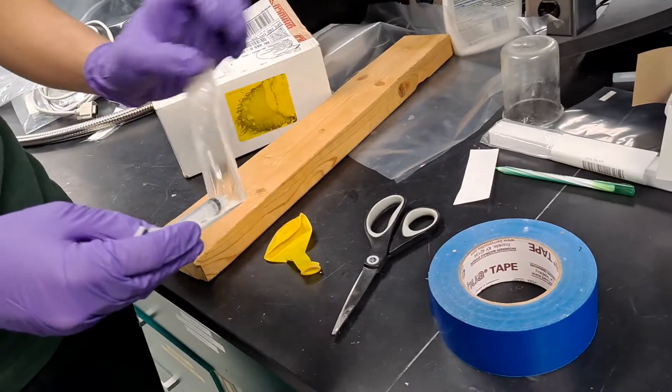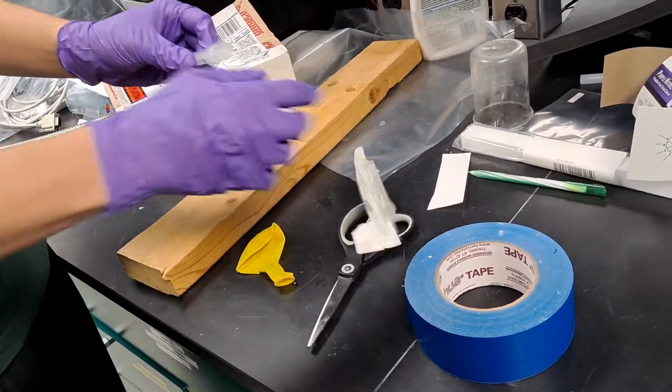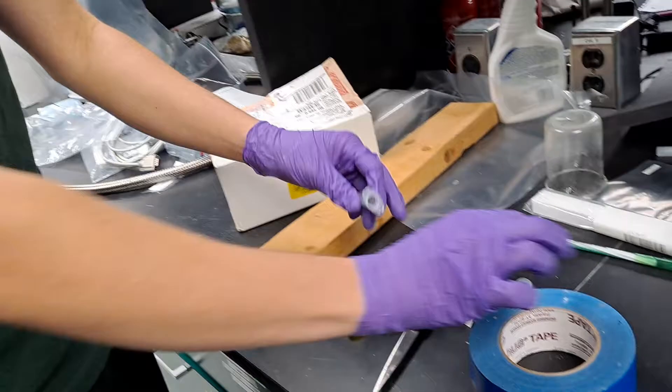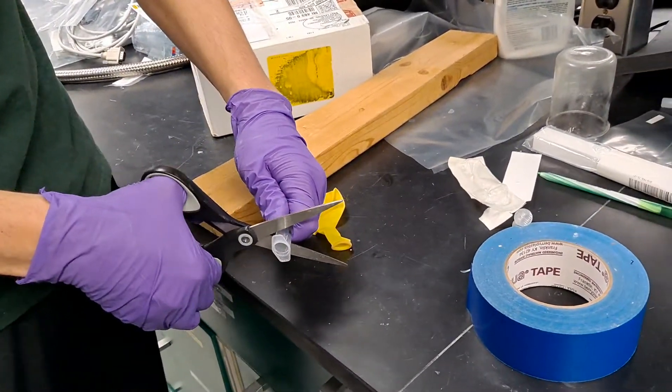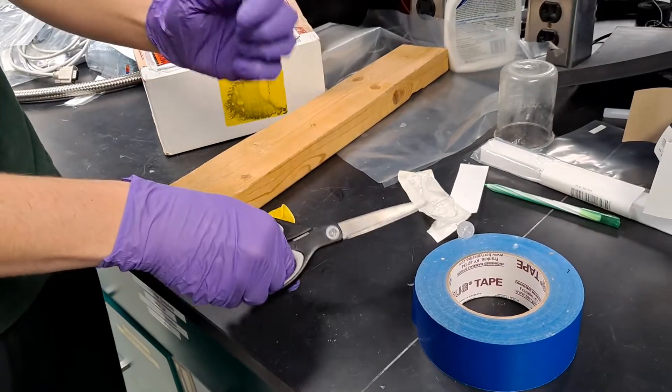First, what you do is you take the syringe out of the packet and you take the stopper out. Then use the scissors to cut off the end, like that.